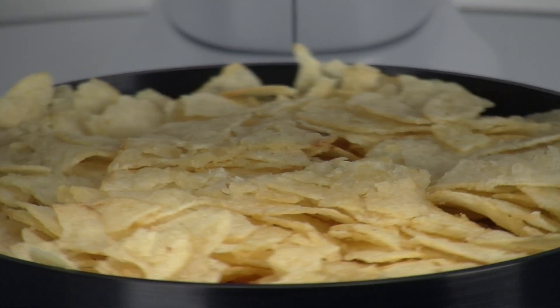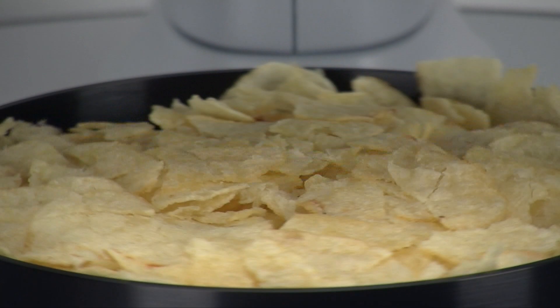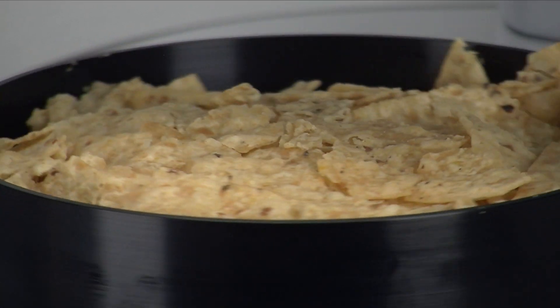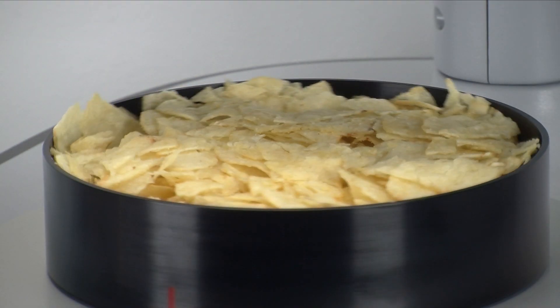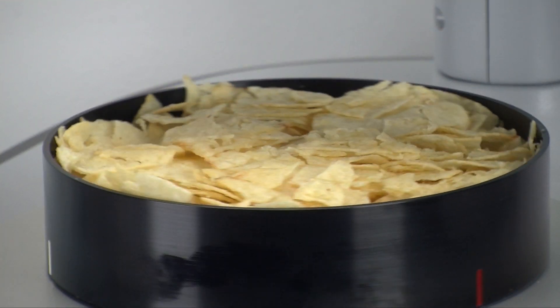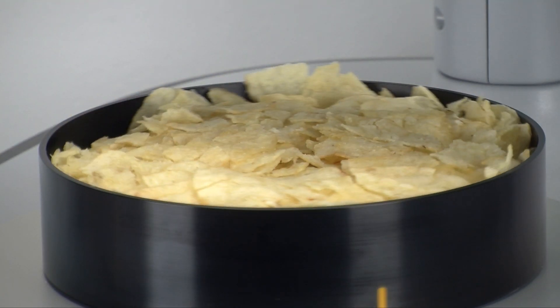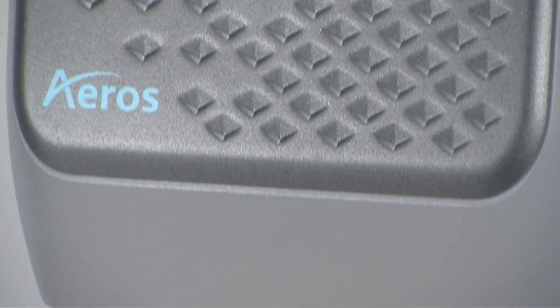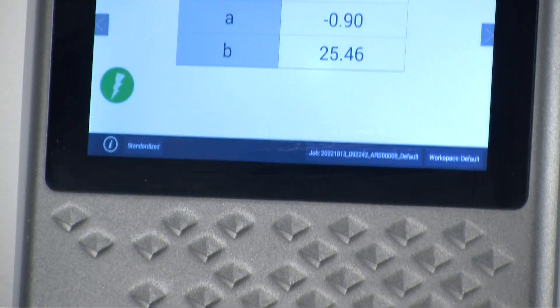A well-known color science principle states the more surface area that is measured, the more accurate the color measurement. Eros provides the largest surface area measurement in the industry by benefit of its rotating platform — 177.25 square centimeters to be exact. Once the measurement is complete, the platform stops and the values are displayed on Eros' large touch screen.